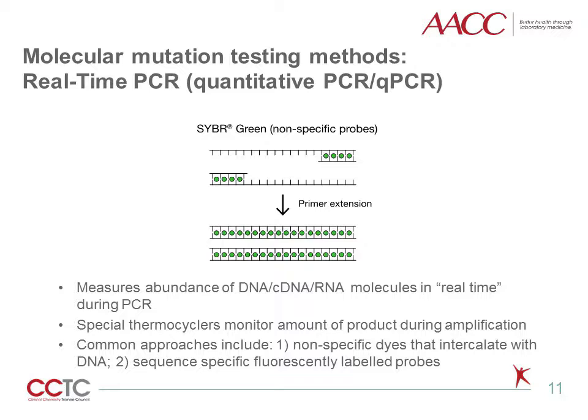amount of target template. 2 common methods exist for this qPCR approach: non-specific dyes that intercalate with DNA, such as SYBR Green, and sequence-specific fluorescently labeled nucleic acid probes, such as the TaqMan assay.